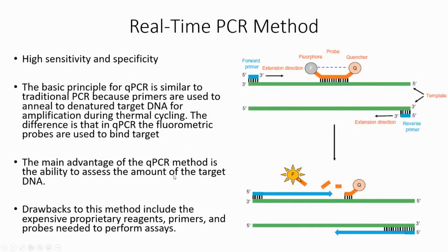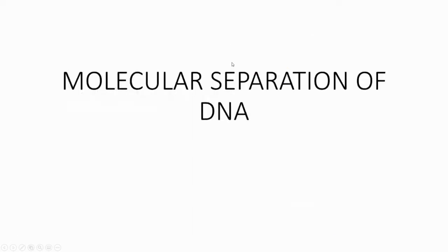But this one is expensive and time-consuming, but it gives you the absolute accurate DNA concentration. But you also need the reference curve, so that you'll be able to evaluate the amount of DNA. But the real-time PCR method we will not discuss further here, because later on we will have a chapter to discuss PCR. And that's the first part of the chapter, on how to determine the DNA concentration.